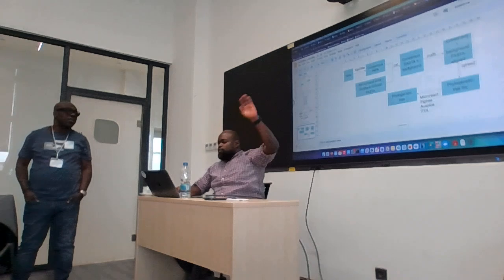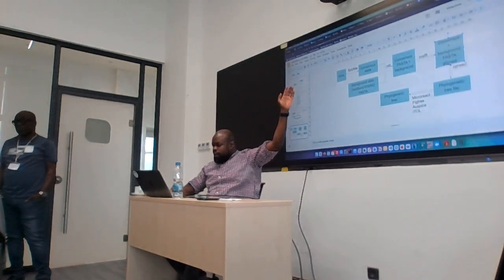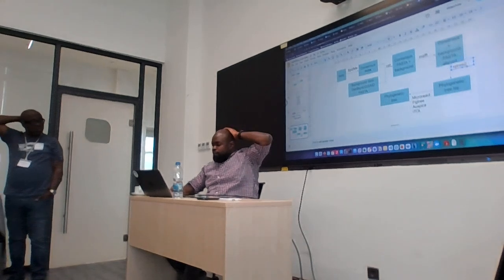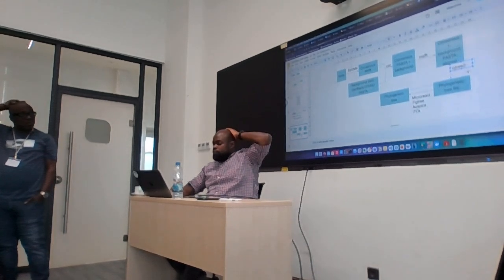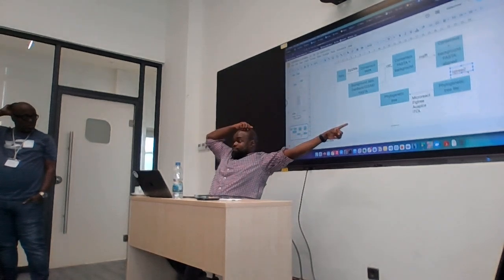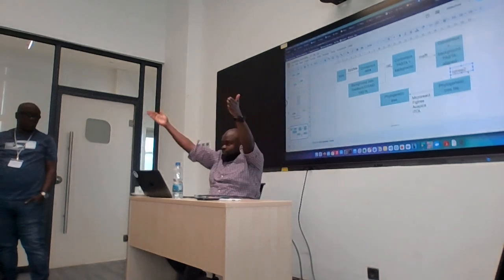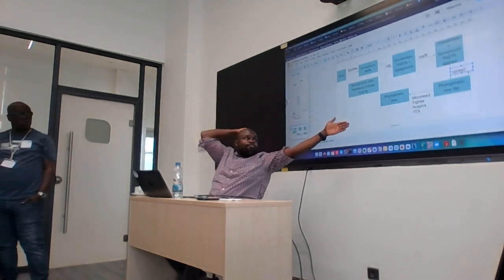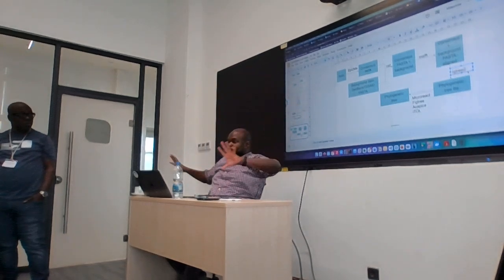So then we have consensus plus background but aligned, okay? And then after we come from lunch, we are now going to use IQ-TREE to give us a phylogenetic tree file. Then once we get the phylogenetic tree file, we are going to visualize it using different tools, and we'll see our phylogenetic tree. Okay? So this is just to give you the general workflow of what you'll be doing. Okay?